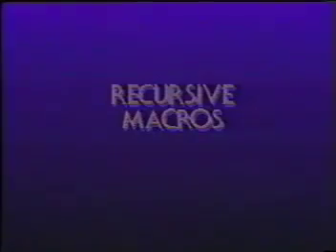If you make an error while defining a macro, pressing the line feed key will cancel the macro definition command, thereby erasing what you have typed so that you may start again. If you wish, you may define recursive macros that call up other macros. Recursive macros often take a very long time to run. Giving the command Control-C will interrupt a macro command before it has completed its task.